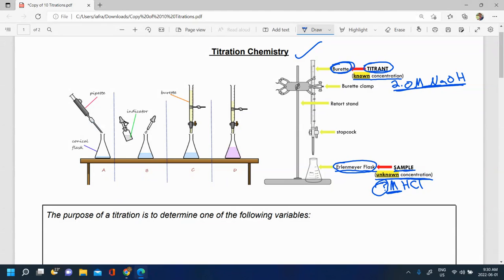The reason we have this fancy setup is because it's very, very sensitive. These reactions are very sensitive. An extra drop here or not enough drops of the titrant will lead you to either overestimating or underestimating the molarity of your sample. You want to be as accurate and precise as possible.